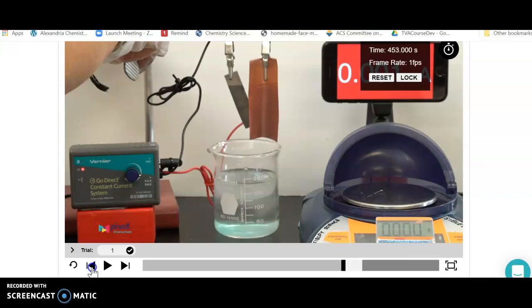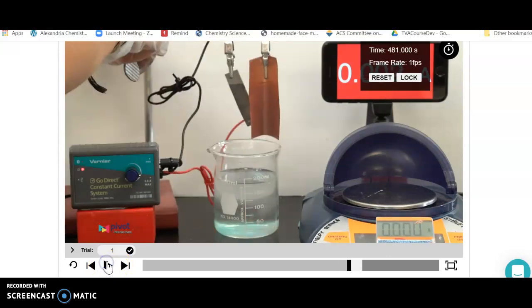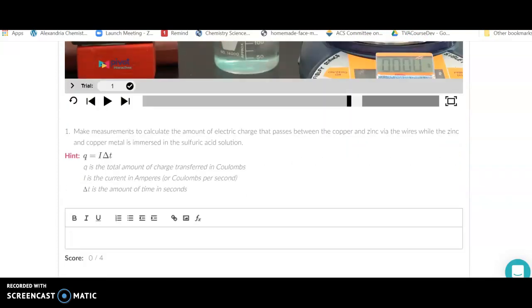You may have to scroll back a little bit to get a good handle on the time. Sooner or later they're going to pop them back in again. You may want to slow down just a bit, and you're going to stop your time right around there. You're going to record your time and amperage.